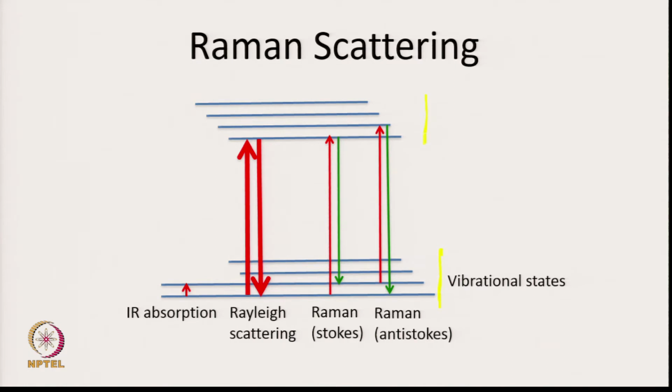So, when a vibration happens, then obviously the energy levels of the molecule change from 1 to 2 by a very small amount, and in IR, we are looking at the absorptions in these energy states, from a low energy state to a higher energy state as the bond stretches or bends or waves. So, this is the IR absorption which happens. But in this case, we have put in a strong laser light. So, it takes the electrons from the ground state to the excited state, and the same are recovered back. So, you get a light out.